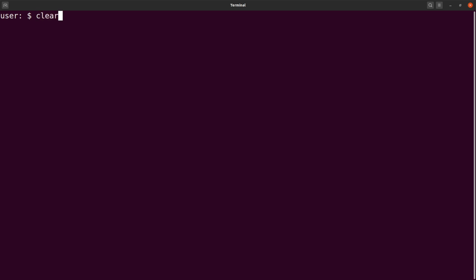Now let me just go back and say this head command here is used to get the first n lines of a text file in bash. Because this was a text file, we just did it here. But with bash or with Linux, it has this flexibility and also allows you to combine multiple commands, and that is why we are able to get this list here and then just pipe it here and add this command to get it. These are things we'll look at in the Linux tutorials that I'll be making. I'll go into details with those ones.